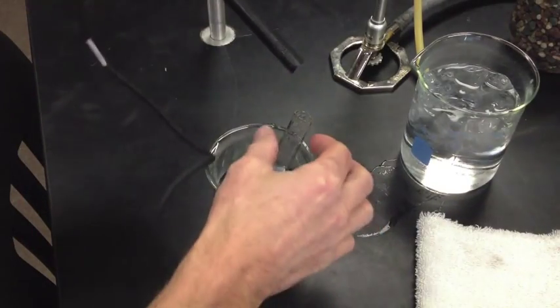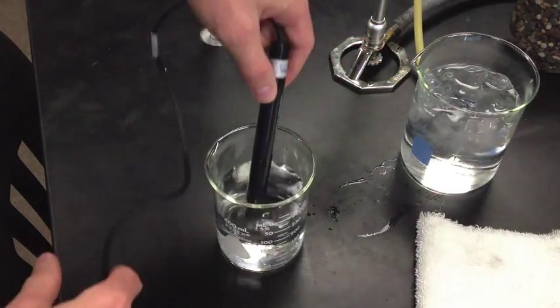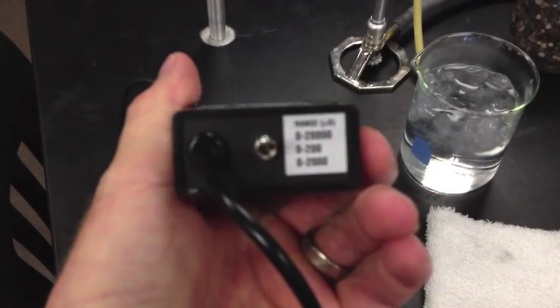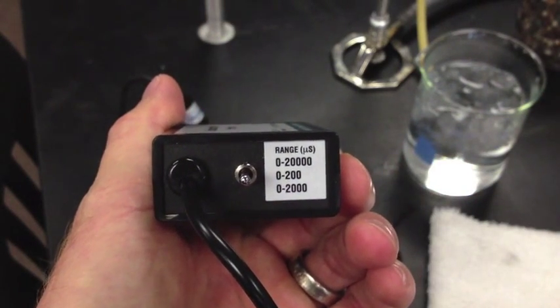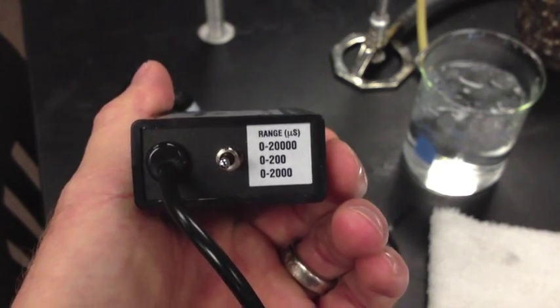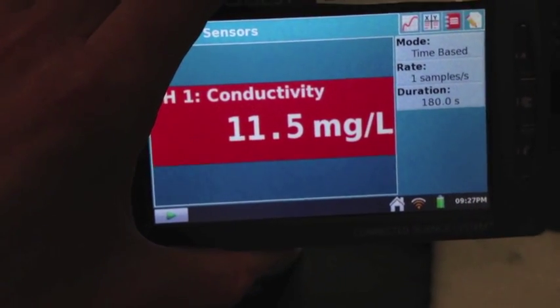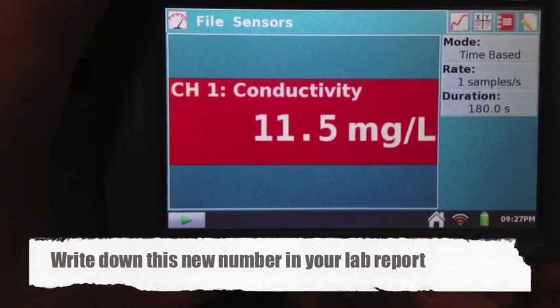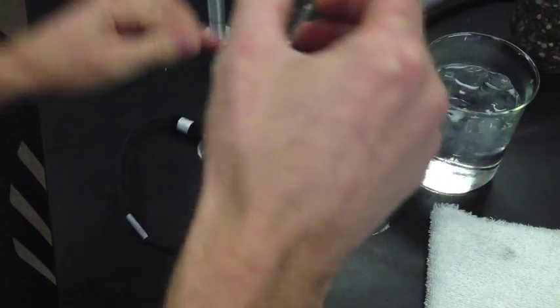When a few minutes have gone by, place the conductivity probe inside the distilled water test tube. Since we're reading distilled water, change the toggle setting to the lowest range: 0 to 200, as the salt content will be very small. Make sure the units are in milligrams per liter. I'm now reading 11.5 milligrams per liter, where we were reading in the 7,000s before. So we definitely purified and distilled the saltwater and obtained very fresh, pure distilled water.